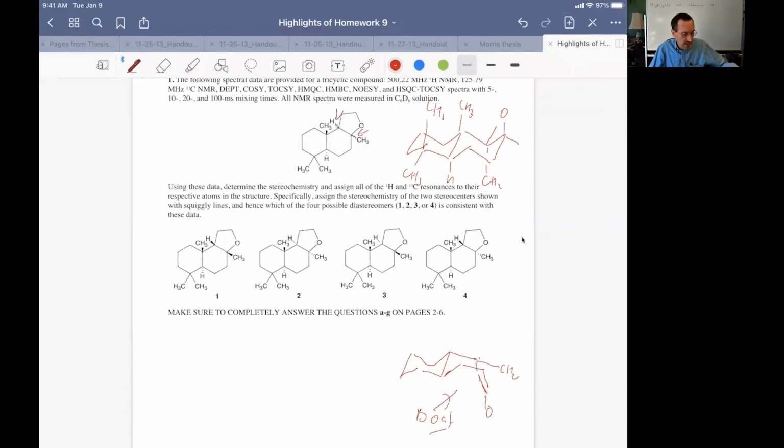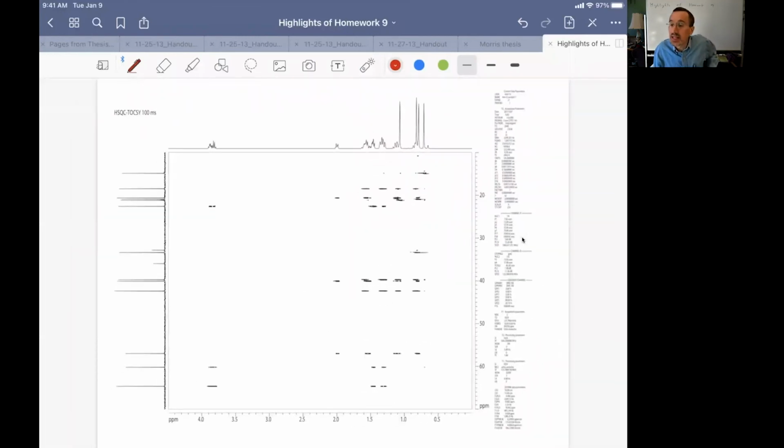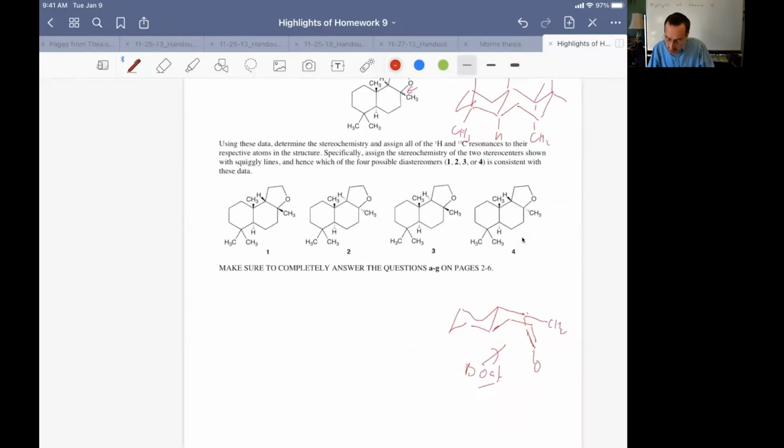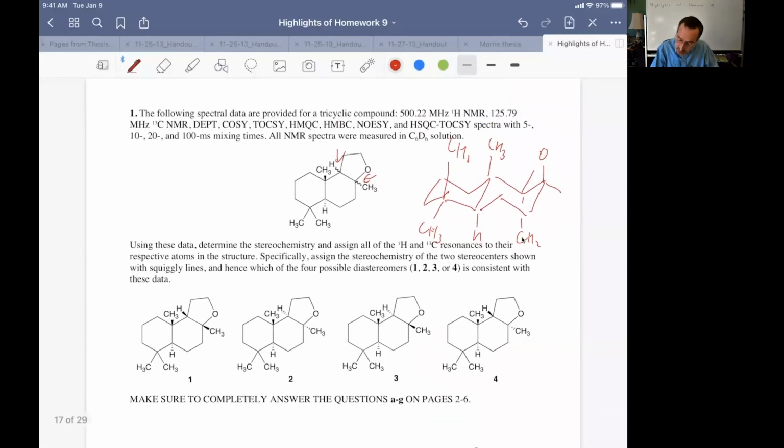Then I want to move on to highlight the HSQC-TOCSY, because that's going to reinforce the lecture. One of the nice things we see in this molecule is we've got 3 distinct spin systems. Remember, the spin systems are the isolated groups of spins. So we have one spin system here. We have one spin system here. Of course, the methyl groups are their own spin systems, but they're kind of trivial. And finally, one spin system here. So essentially one is associated with each ring.